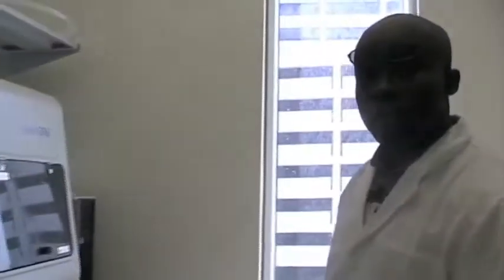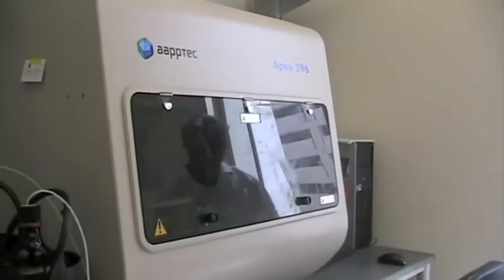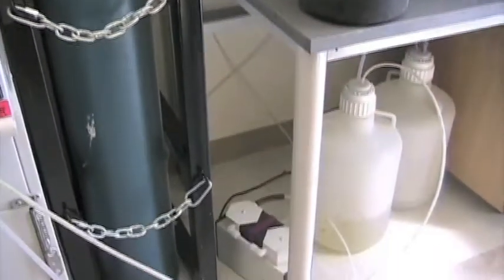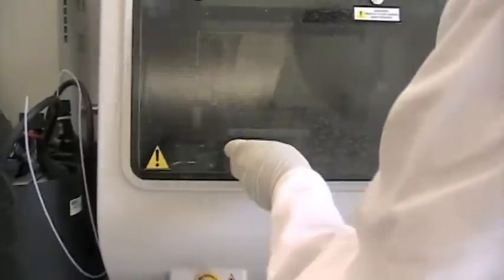The machine I'm staring at right now is the synthesizer. That is where the peptides are synthesized in this lab. And in a little while, we'll open the machine for you to see the wells and then the amino acids in vials and then all the other chemicals that are used in synthesizing the peptides.